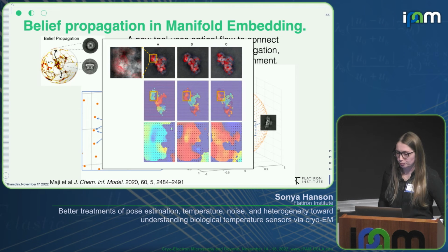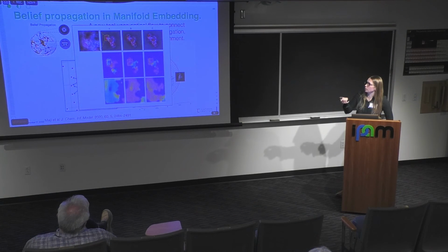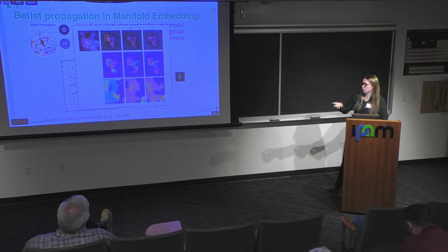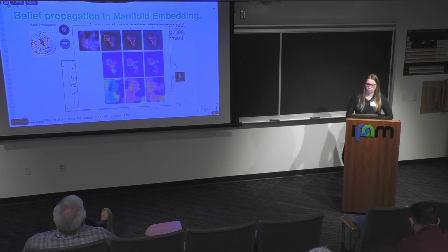In practice, the optical flow looks at these projection direction movies, defines the direction of these conformational changes, and links up all of these projection directions across SO3.